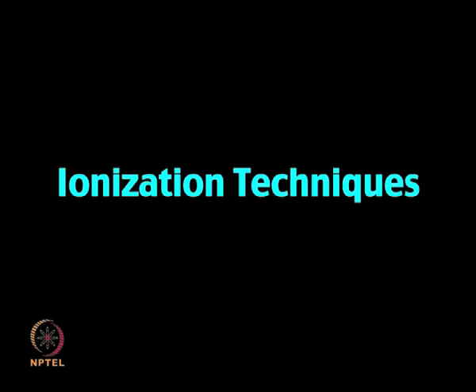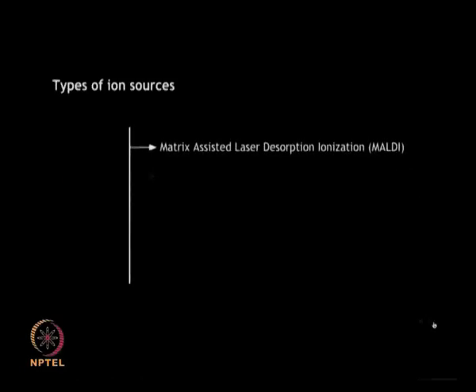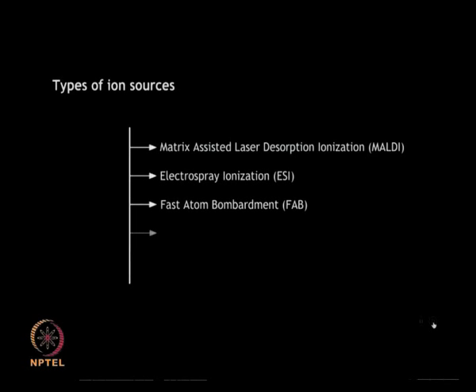Most commonly used ionization sources are MALDI and ESI. Additionally, there are other ionization sources such as fast atom bombardment FAB, laser desorption LD, and plasma desorption PD. Let us discuss the two most commonly used soft ionization techniques, MALDI and ESI, in more detail.